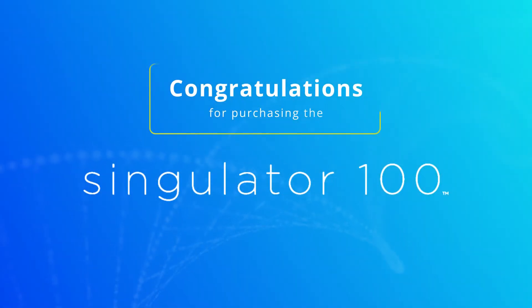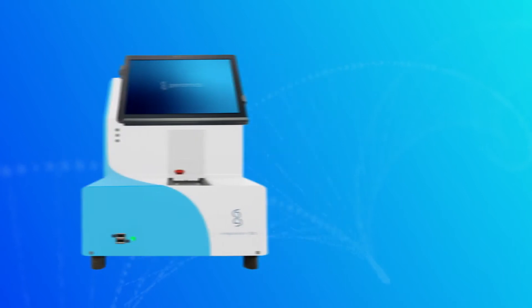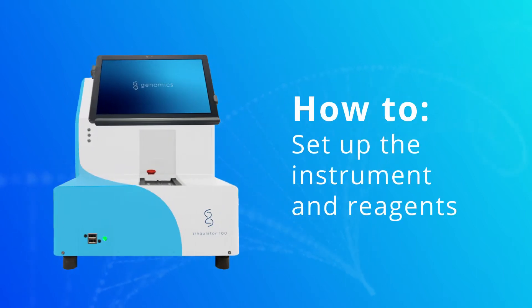Congratulations on your purchase of the Singulator 100. This video will guide you through the steps to properly set up the instrument and reagents.